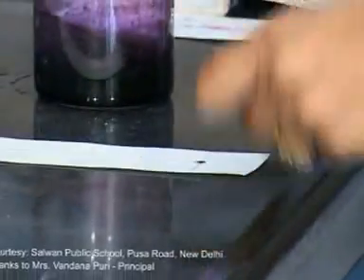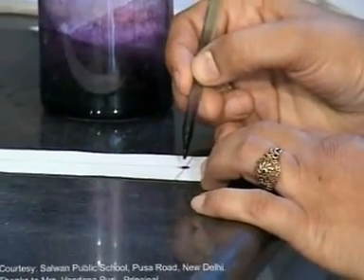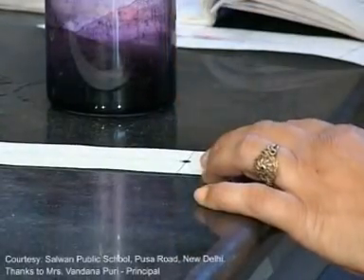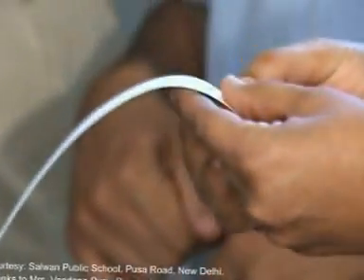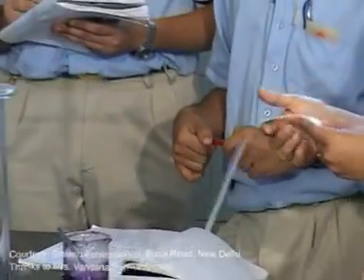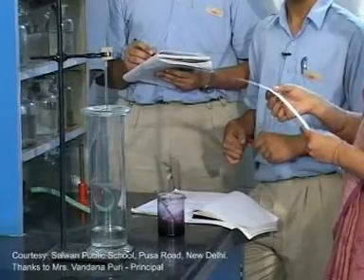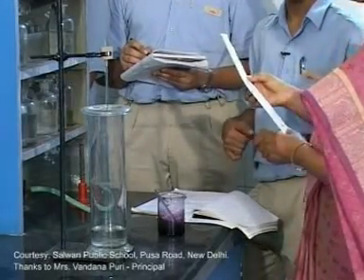Again dip the fine capillary tube into the mixture and repeat the process — that is, spotting. Why is the process repeated? This process is repeated so that the spot is enriched in concentration, but one precaution should be taken: the spot should not grow in size, otherwise the separation would not occur.